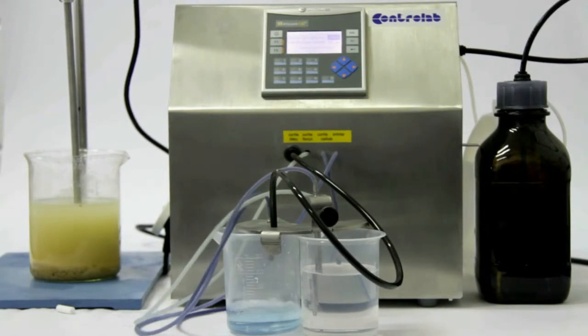During the cell cleaning, the mass of the sand is weighed for the automatic calculation of the blue value.